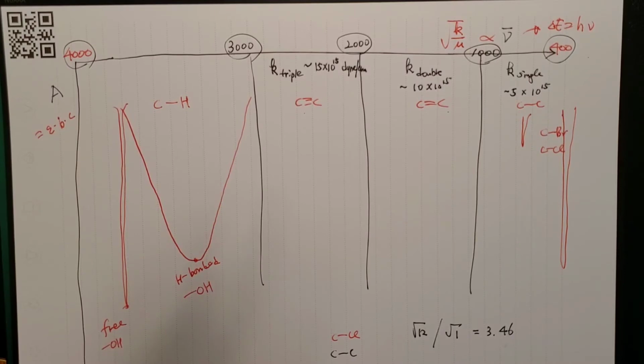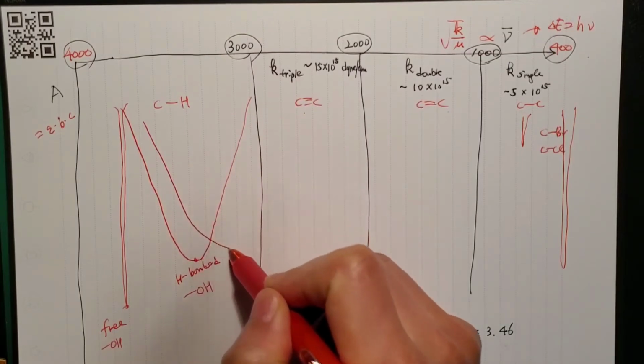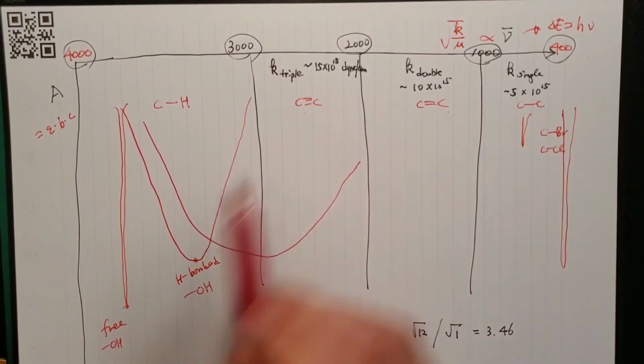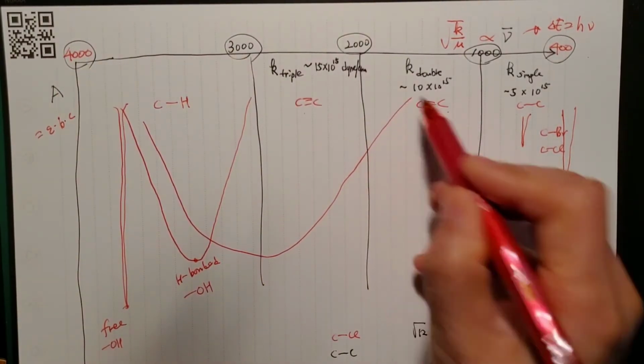In certain cases like a carboxylic acid, they are more efficient in making hydrogen bonds. If you draw out the structure, you can see they can actually go far deeper, passing 3000 and going to even 2000 sometimes.